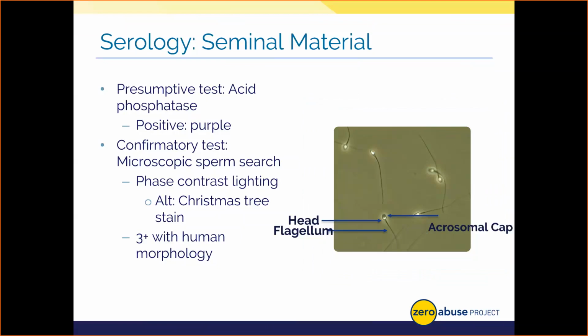How do we confirm that we have, say, human sperm from a seminal fluid sample? Well, we examine a sample from an extract, and we look at it in each field of view under a microscope for sperm across the whole slide, if we're not using the Christmas tree stain. We look for human morphological or characteristic features of human sperm. When you tap on the slide, for example, believe it or not, the sperm will actually roll and they kind of take on the shape of little bowling pins.